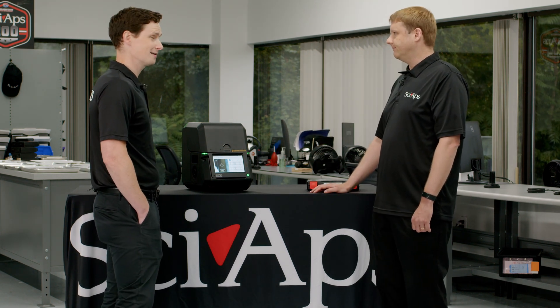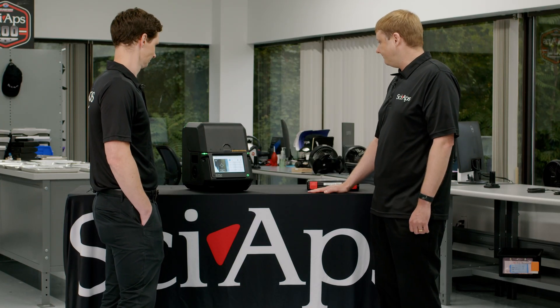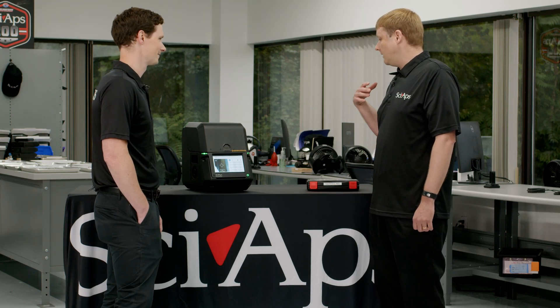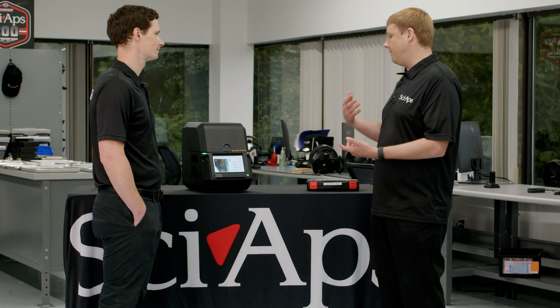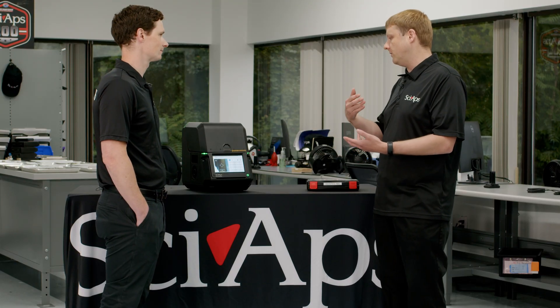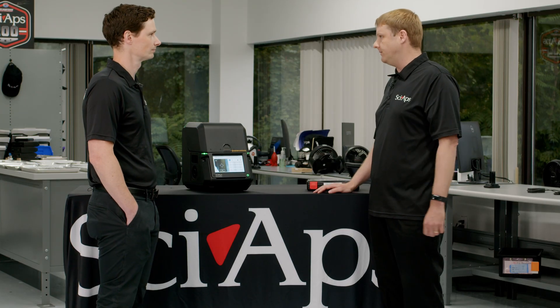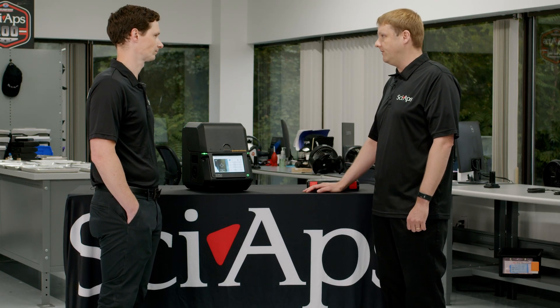Well, thank you Brendan. I think that's a good overview so far. Anything else you'd like to say? I think it's useful for a lot of different application areas — mineral exploration, environmental testing, or grade control. Lots of different applications where you need to measure lanthanides or other heavy elements.